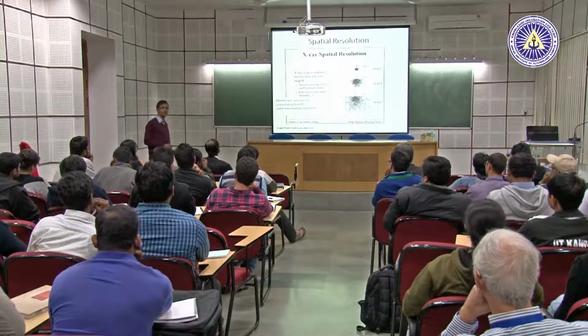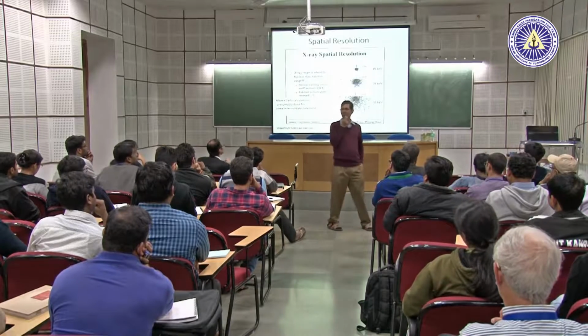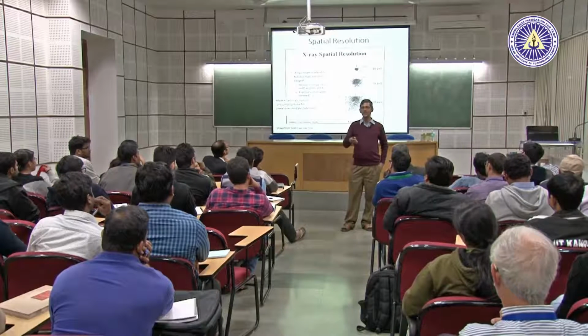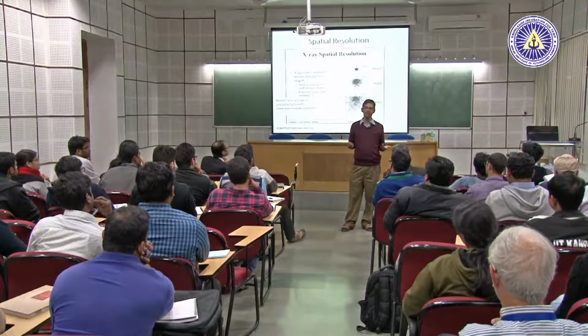Well, one more thing I should tell you, the yield of X-ray depends on 3 factors, right? One is the atomic number, that's obvious. Why? More outer shell electrons, so they can jump. The second one is absorption. All the X-rays will not come out, they can get absorbed.